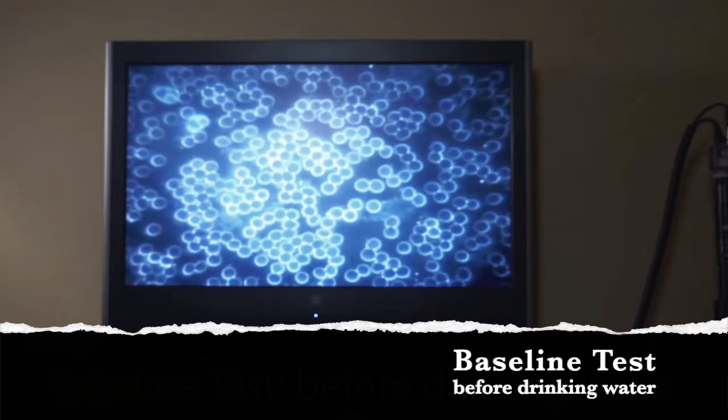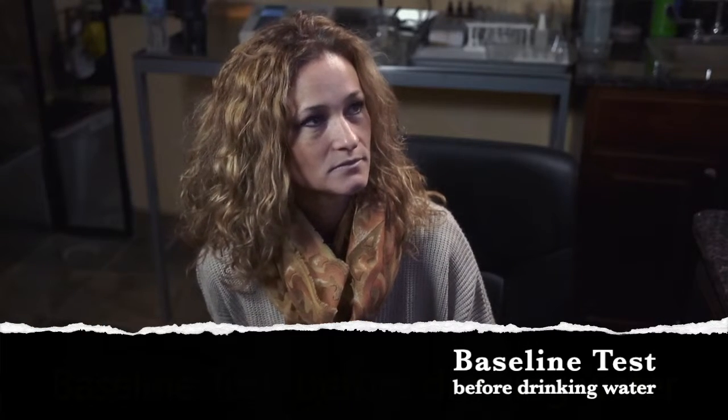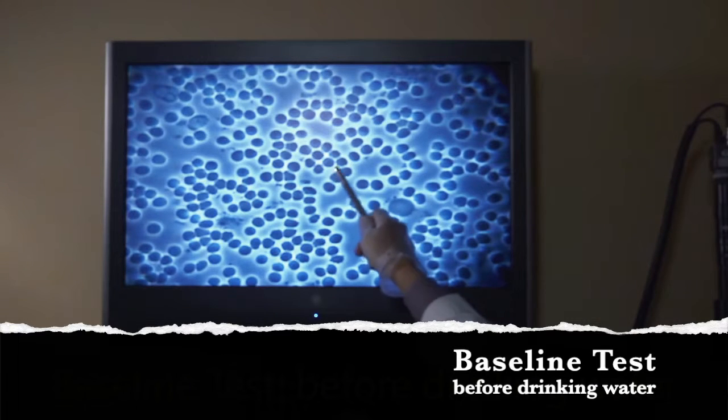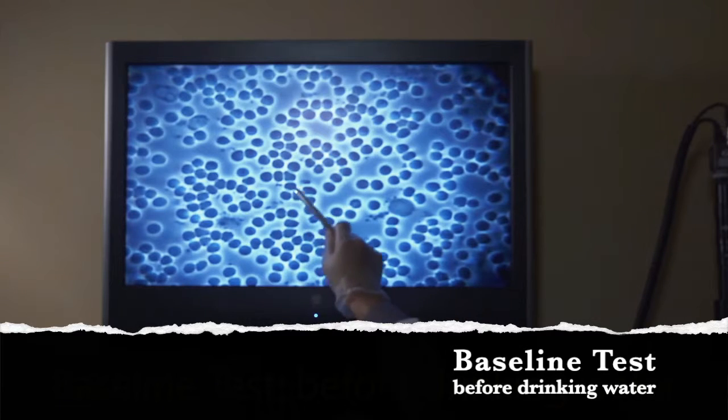And I'm going to change the phase so we're able to see better. But right here, the membrane is collapsing and breaking. And I could see it on several ones. It'll show better on this next screen. There isn't uniformity. Some seem bigger than others, it's bigger and that's a little smaller. The other thing is the membrane is jaggedy, which is unhealthy, versus nice and round. We're seeing a lot of debris and things that shouldn't be in there.